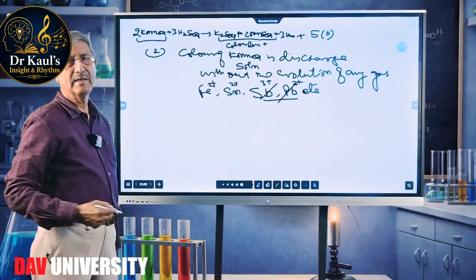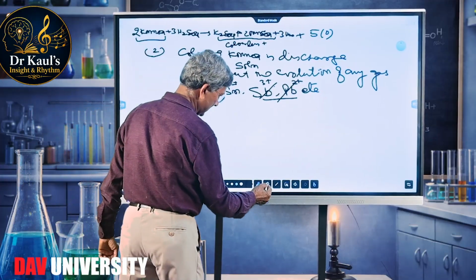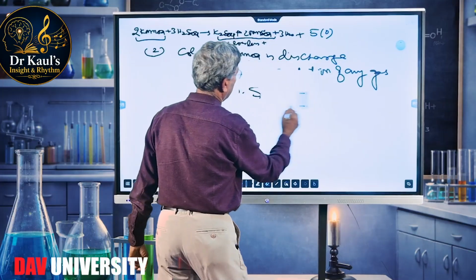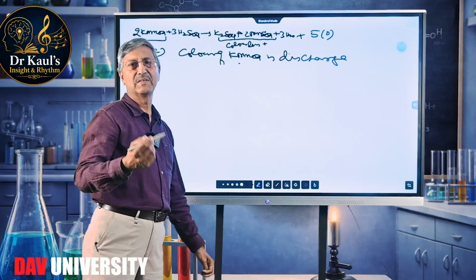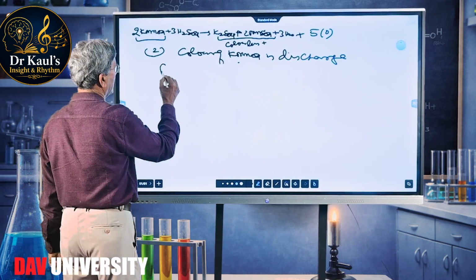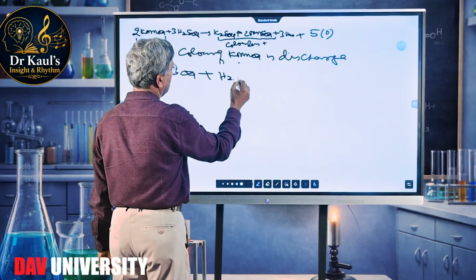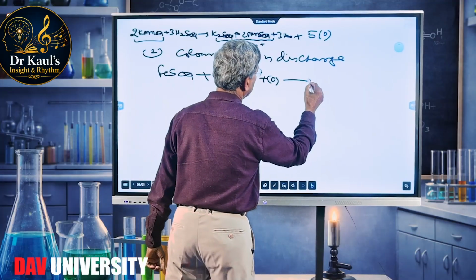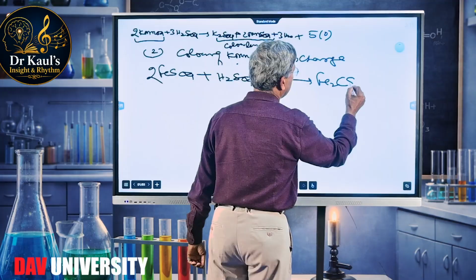We have got tin and lead, and I'll be discussing by taking the example of ferrous the mechanism of the reaction. You see, any ferrous ion present in the salt combines with sulfuric acid to give you ferrous sulfate. This ferrous sulfate, in the presence of H2SO4, consumes nascent oxygen to provide ferric sulfate.